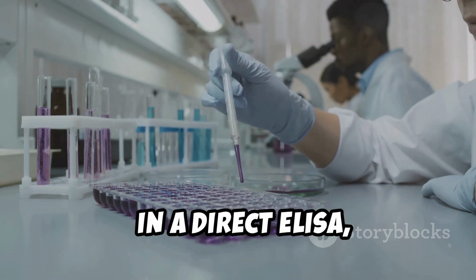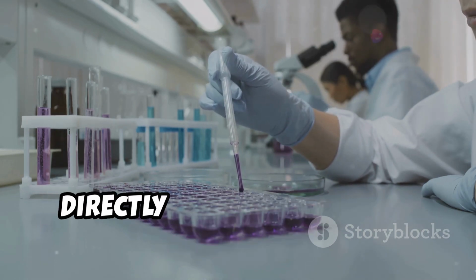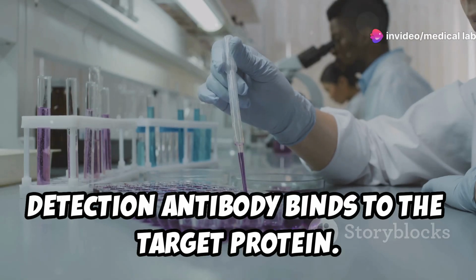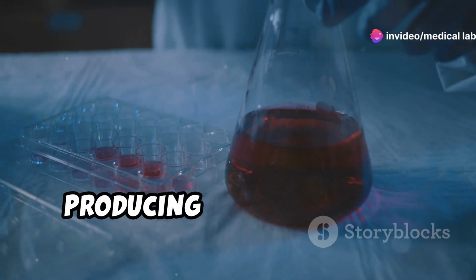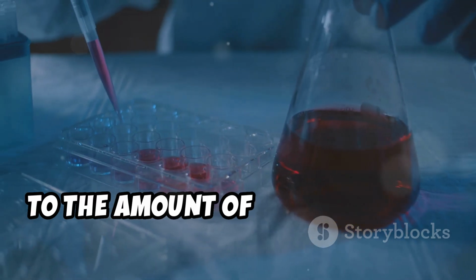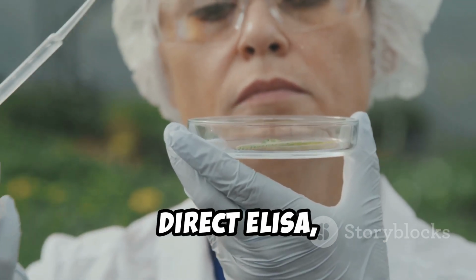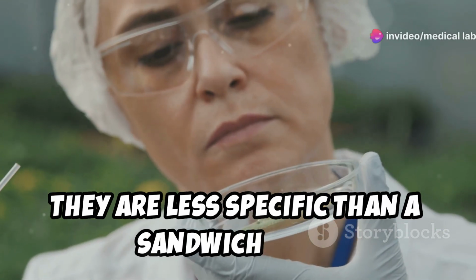In a direct ELISA, an antigen or sample is immobilized directly on the plate and a conjugated detection antibody binds to the target protein. Substrate is then added, producing a signal that is proportional to the amount of analyte in the sample. Since only one antibody is used in a direct ELISA, they are less specific than a sandwich ELISA.